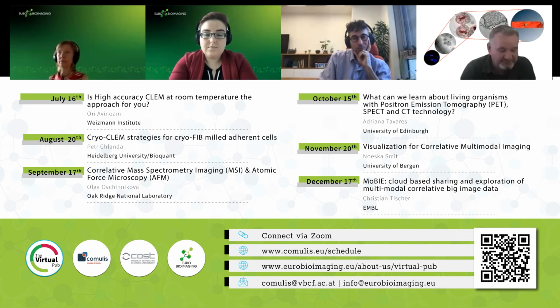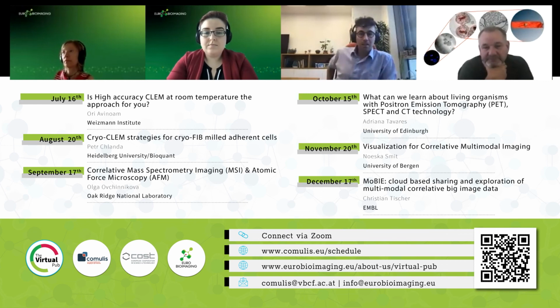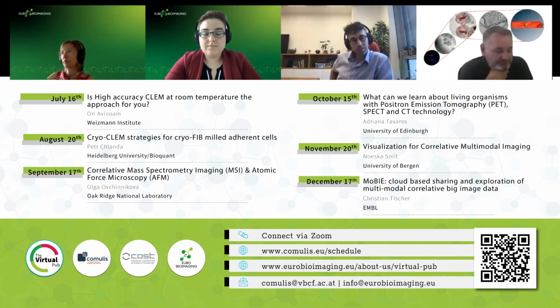So you don't want to spend more than a day to set up, because if you run overnight, you have a short time for acquiring. If you have, let's say in tomography, 30 positions, it's already quite challenging for a night sometimes. And if you spend the whole day doing this, plus setting up the microscope, you can have a loss of throughput at the end.